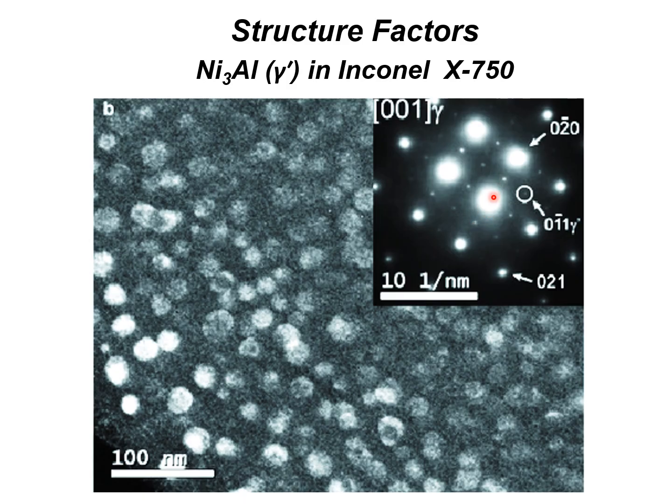And that's because it just turns out that you get constructive and destructive interference, and half of the atoms are lined up so that they cancel the scattering from the other half. So for half the plane spacing, this is the 010, for half the spacing, 020, you get strong diffraction.